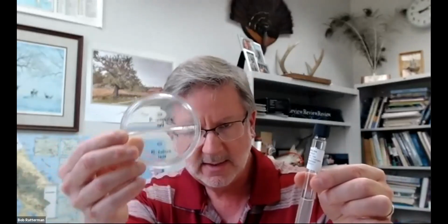So what the students did was they inoculated one tube with Micrococcus luteus and another tube with Proteus vulgaris. Now, you know from the previous experiment that Proteus vulgaris is motile and Micrococcus luteus is not. So how do we see that in that particular medium, which is actually stabbed, just like is described there at the top of page 124?